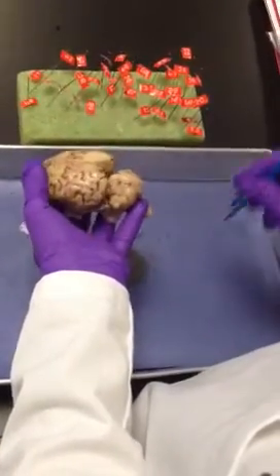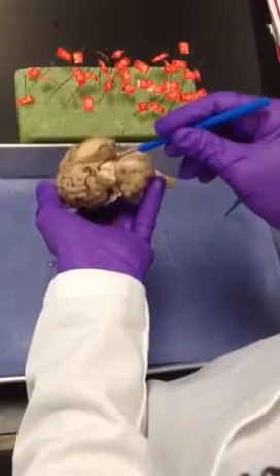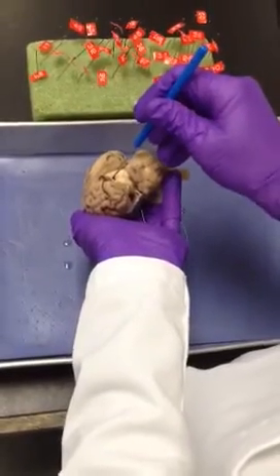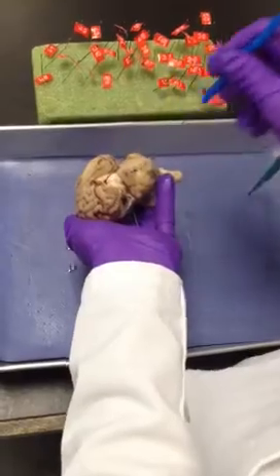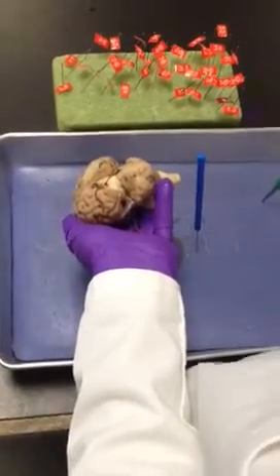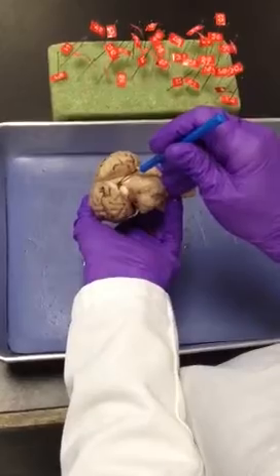Above corpora quadrigemina, we should see the pineal gland. And this one, it's hidden. So I have to kind of separate this. And all you can see really is like a little dot right there. It's just a little piece of tissue, kind of pyramid shaped, if you will. That's your pineal gland.